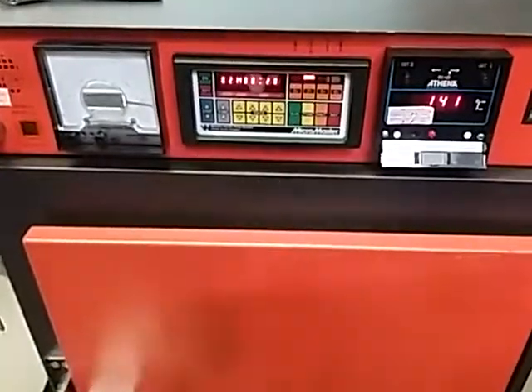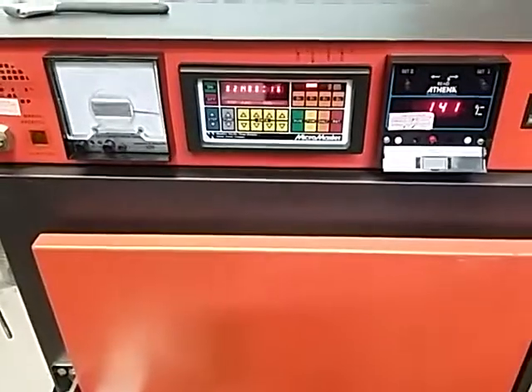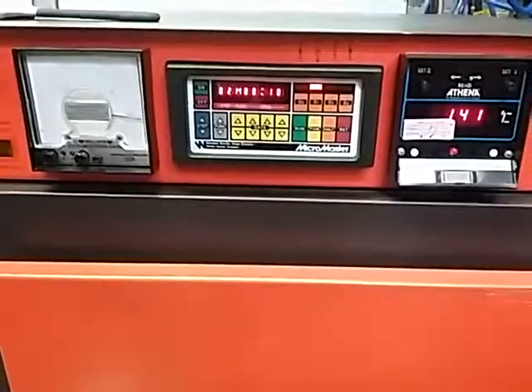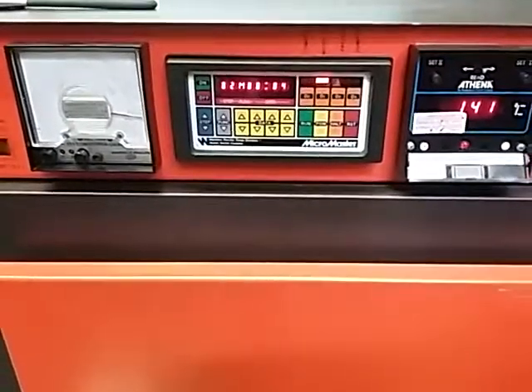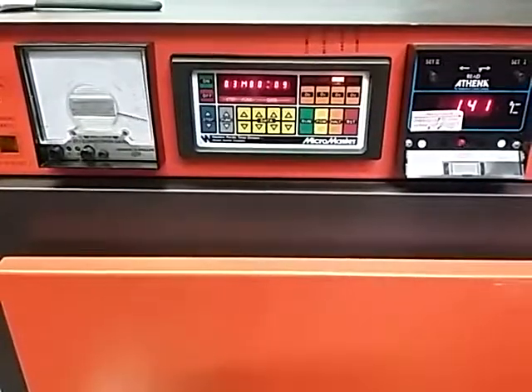The YES five eight oven at JMI. We're going to show you the different modes of operation. Right now we're in nitrogen mode. You can see our vacuum level to the left and our temperature on the right.